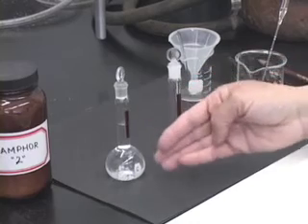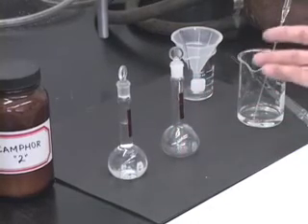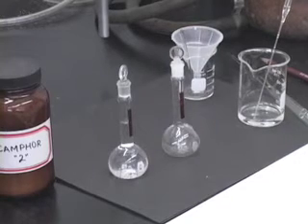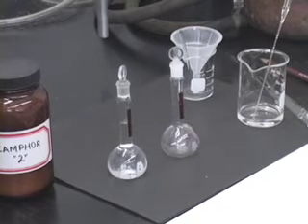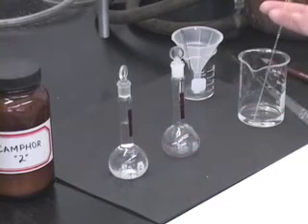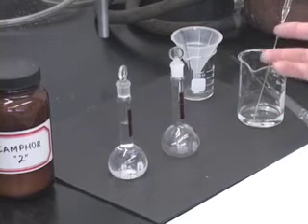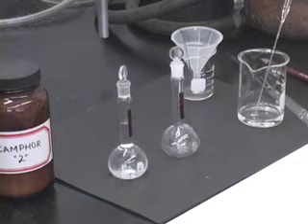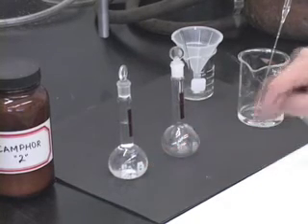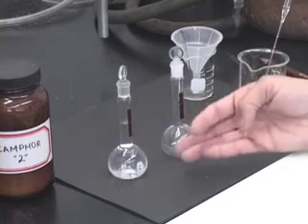So, I have my camphor solution. Similarly, you can prepare the solution for your product, and then you are all set to determine the specific rotation of the camphor and your product solution that you would prepare. This is how we prepare a solution of known concentration to exactly the second decimal place in volume — in this case, 25.00 milliliters.